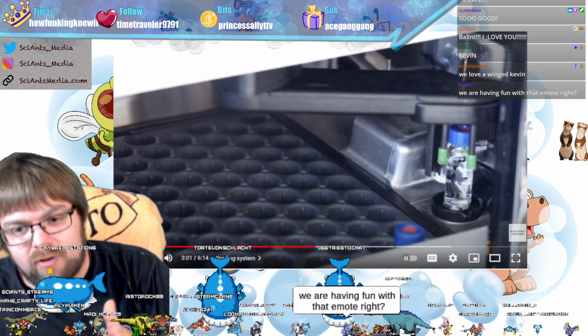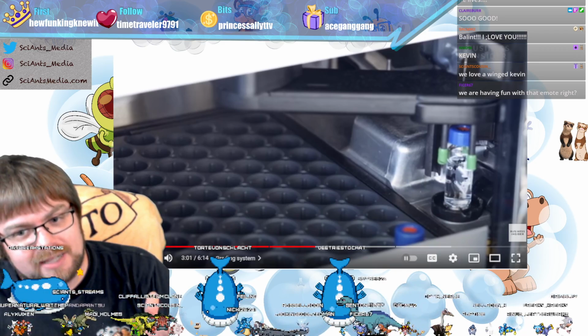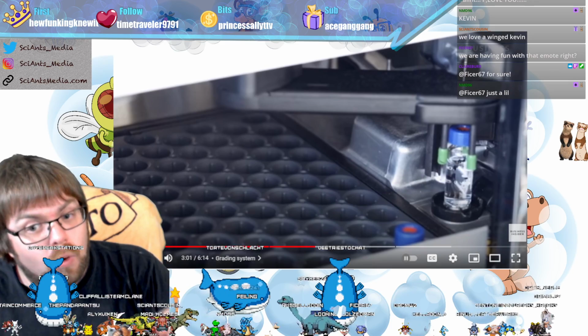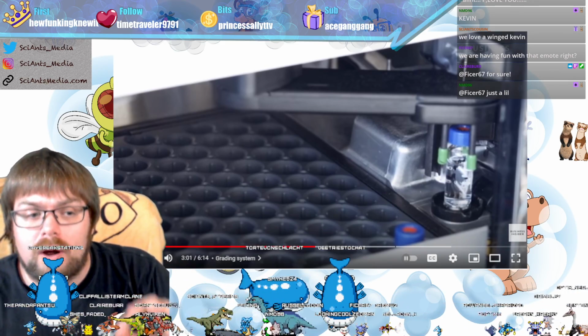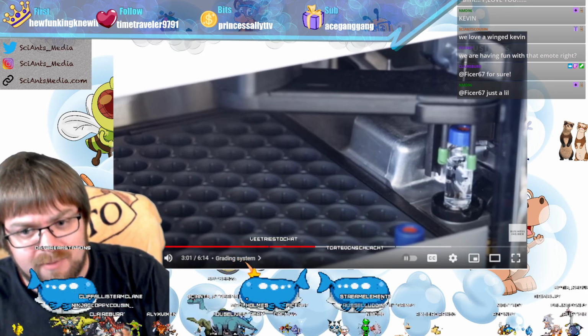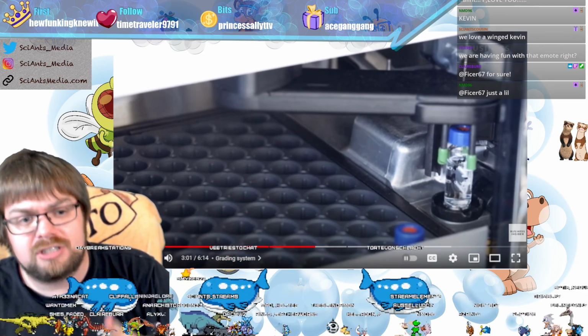Not every sample takes an hour either. It just depends on what resolution of images that you want, right? So, like, do you want to know all the compounds, or if you already know what compound you're looking for, then you can run a much shorter experiment targeting just that particular region of the spectrum.